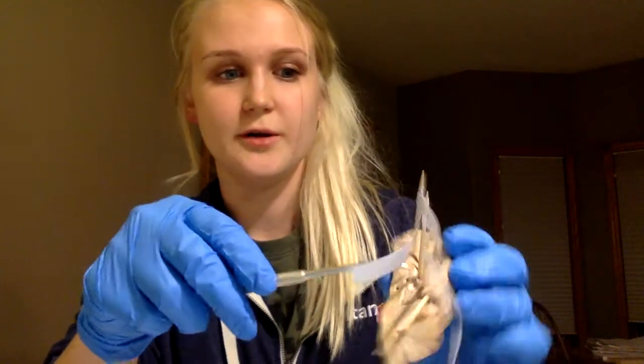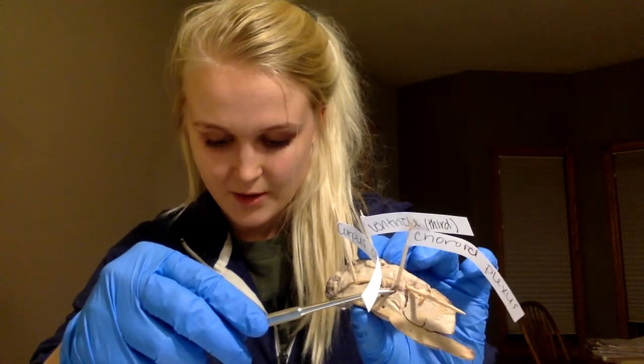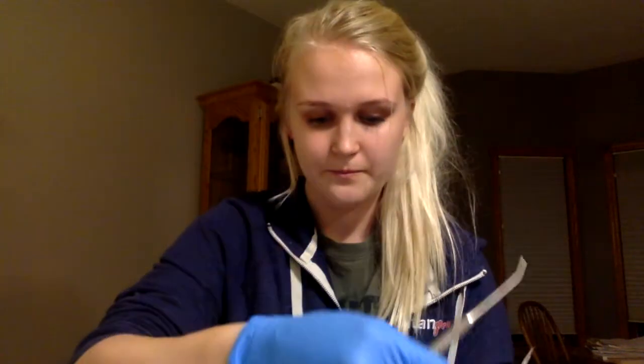I was able to locate the third ventricle right here. And there are a total of 4 ventricles, or cavities, in the brain, which are filled with cerebrospinal fluid. Here is the choroid plexus, and its function is to produce the cerebrospinal fluid.